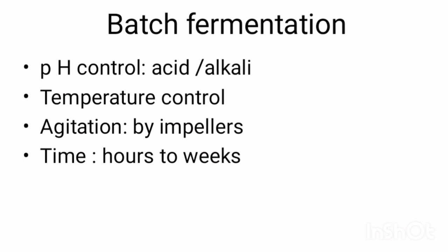Next is the time. The time required for a batch fermenter varies from hours to weeks. Throughout this time, contamination must be avoided and the vessel contents must be agitated and their temperature controlled.